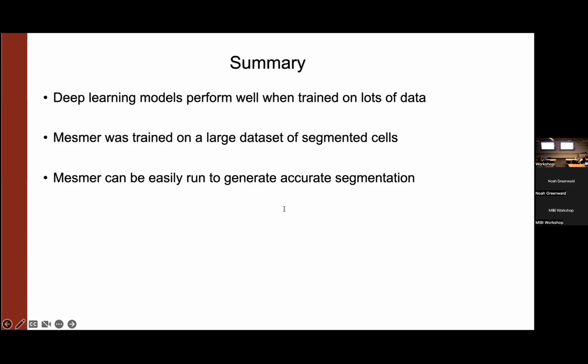Are there automatic ways to define which channels to mix for passing them as a membrane marker? Nope. Right now, we just do visual inspection and expert assessment. If someone has an idea of a better way to do it, all of the code in ARK Analysis is contribution friendly. So if you want to put something together, like using some score to figure out which channels work and which ones don't, definitely reach out to us. I think that would be a cool option to add. But right now, the input is you just say, here are the channels I want to combine, and then it combines them.